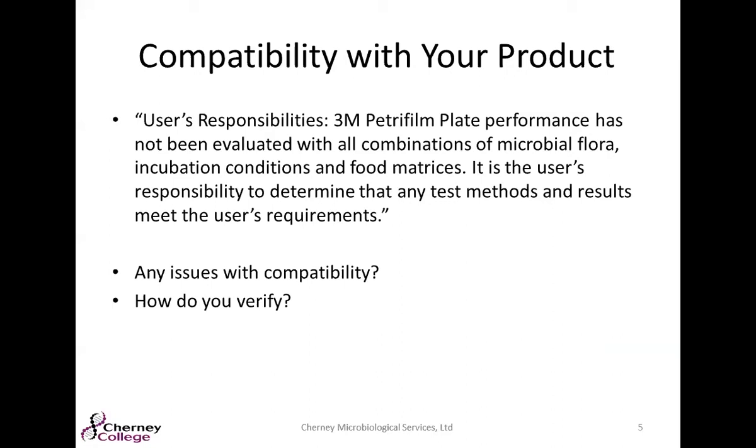So with your product, you should identify if there are any issues with compatibility, and how you would verify if you did have issues. It's recommended that you do a side-by-side comparison with your product on the Petrifilm and your product set up on an agar plate, just to make sure that those counts are similar. And if you had any large variances, 3M Petrifilm might not be your chosen method to go, as you might have issues with compatibility.